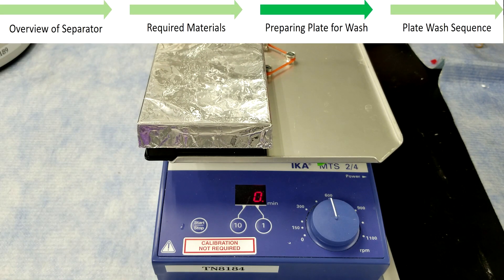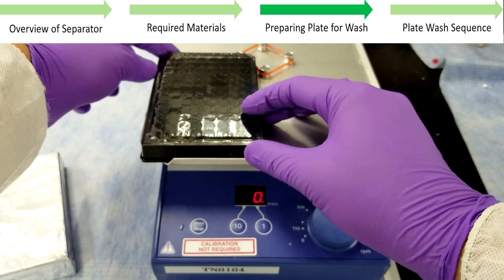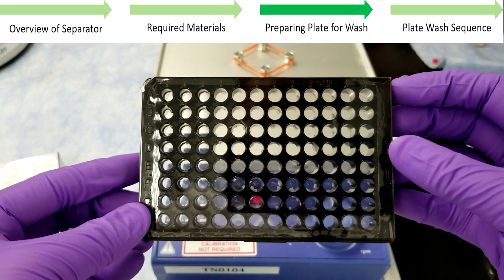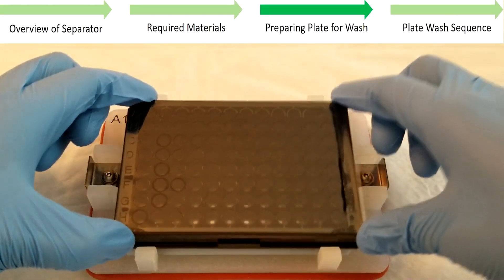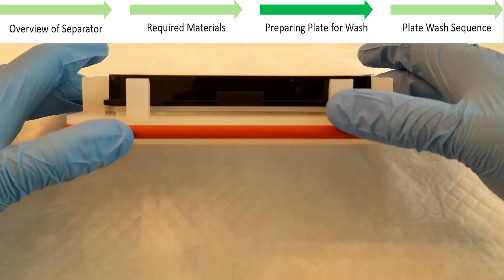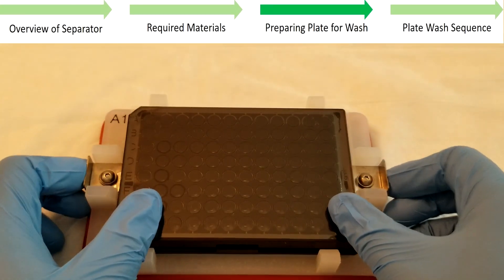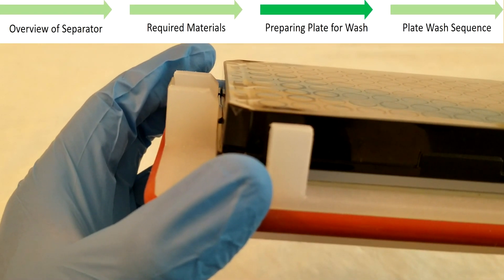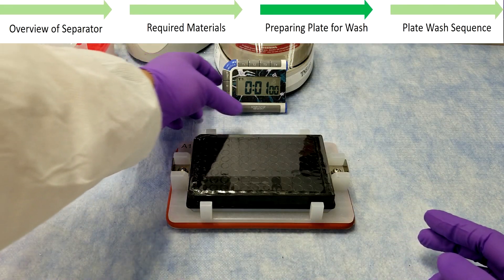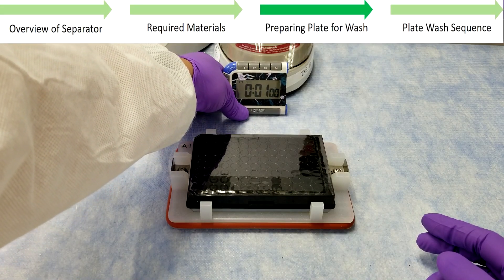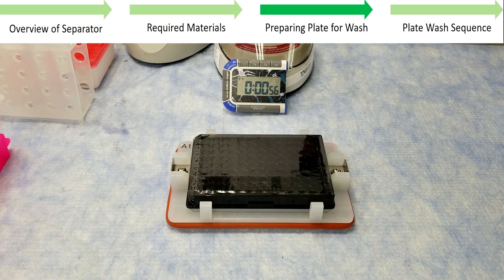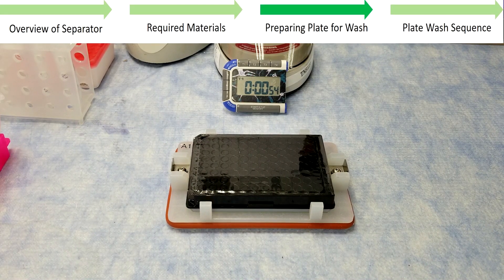To prepare the assay plate for wash, carefully remove it from the orbital shaker after its previous incubation is complete. Secure it onto the separator, ensuring that the plate is flat, both latches are locked, and that the lip of the plate sits below the latches. Incubate on the bench for at least 60 seconds to ensure that the beads are firmly held by the magnetic pins.